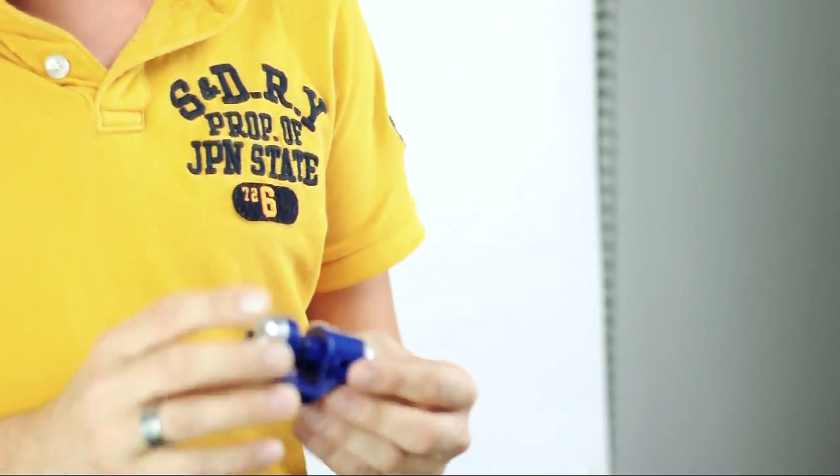Hi guys, Alex here from Paladone again. I hope you're doing well. I'm really, really excited about this — it's so cool, you wait until you see it. And it is this: our Discovery Channel smartphone microscope.